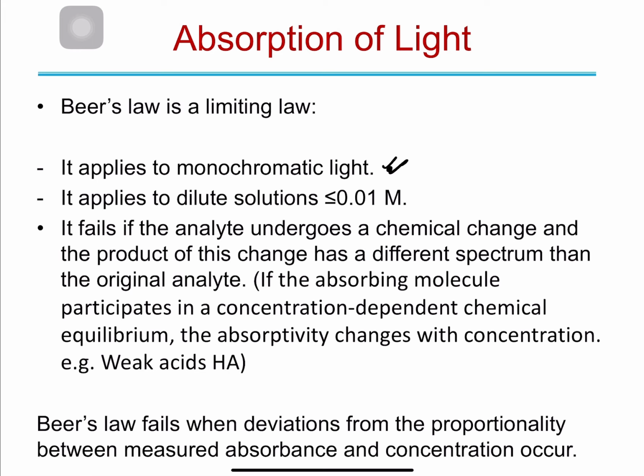Also, it's only applicable at very low concentration. So normally we have to dilute our samples many times to get to a concentration as low as possible in order to be able to use Beer's law. At higher concentrations, the law will not be applicable, because when you do your calibration curve of concentration against absorbance, you usually get a straight line. But if you get to a much higher concentration, the curve will no longer be a straight line; it will start to be curved like this. So the Beer-Lambert law does not apply at higher concentration.